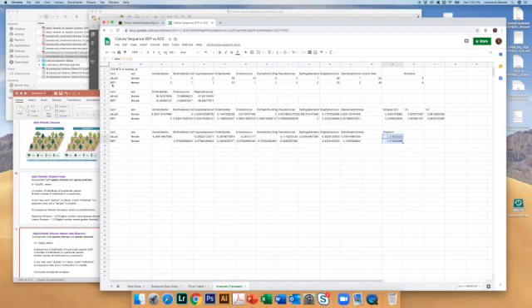But keep in mind that these data are not the same as data that would come from the complete sequencing, the next-gen sequencing of the microbiomes that came from these beetles, because these data are based on individual colonies that were picked from cultured bacteria that came from the microbiomes of these beetles. This is going to end the recording I have on this analysis. It's worth doing this analysis and including it in your results, but there are other analyses, in particular the next-gen sequencing analyses, that you will want to do.